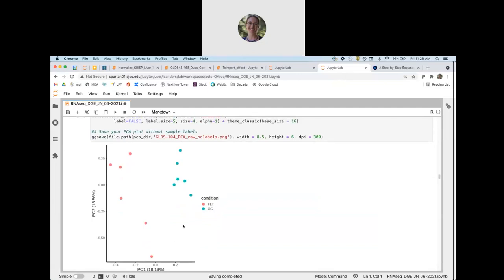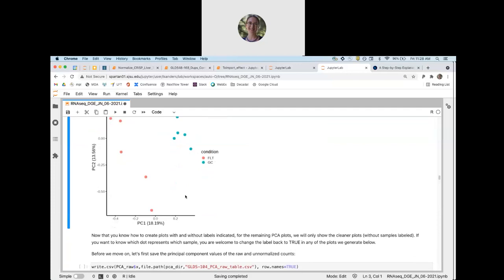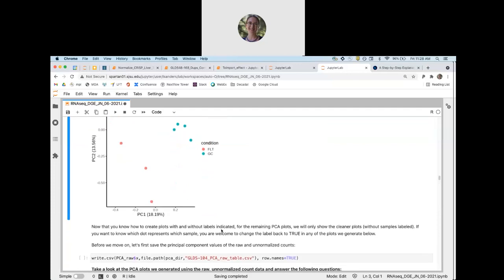Phil notes that the color argument is spelled using British spelling. If you spell it with the American spelling, the argument is not recognized and you get a default black plot. That is a really good point. Thank you, Phil. Must be British developers. All right. So also, for going forward, super annoying. Yeah.